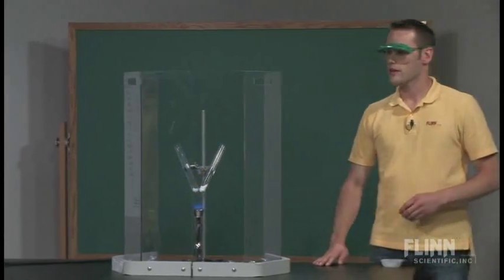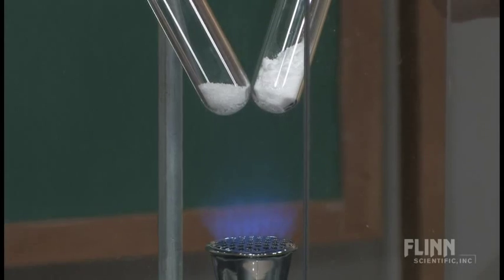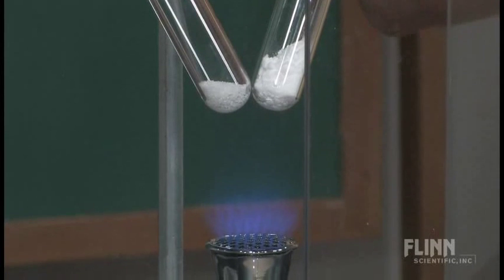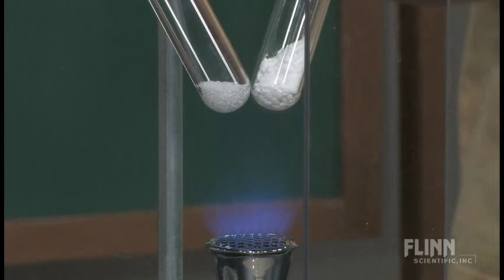When we heat these up with the Meker burner, they're going to start to get very, very warm. We want to get to the point that both of them melt. By having them side by side, all of the heat generated by the Meker burner is going to melt both the compounds, and they both melt about the same time.